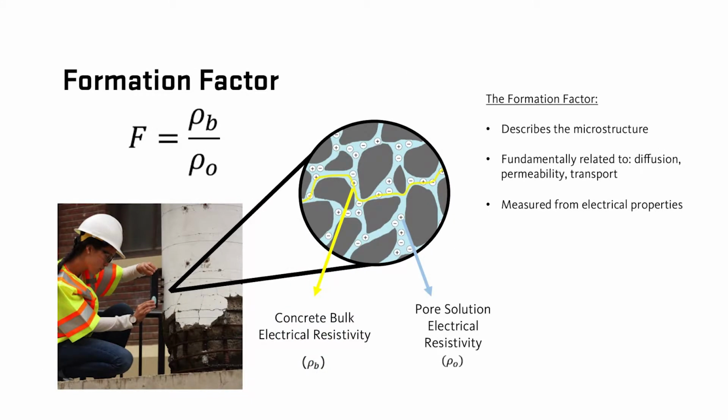Since XRF is a commonly used device in the cement industry, this method could potentially enable cement manufacturers to use a tool already at their disposal to provide more information about the cementitious pore solution, such as the ionic composition and resistivity, for numerous applications and at a lower cost and testing time than conventional methods. Essentially, this method could extend the applications for the use of an XRF for a variety of cement and concrete studies.